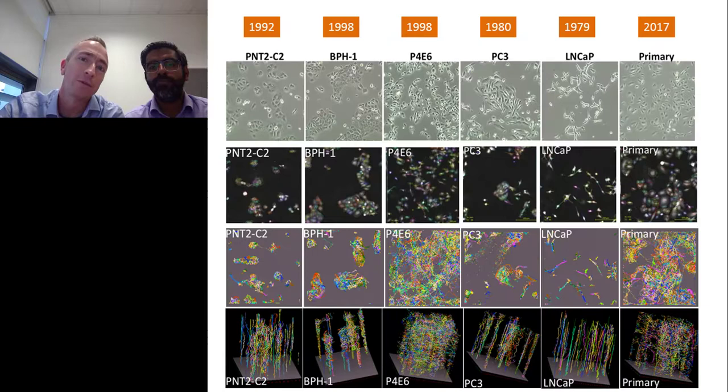And this is just it. If we look back, this is research that they did last year on some of the primary cells. If we look at the time tracks down at the bottom two panes, it's really good to look at the tracks. They behave remarkably differently over the same time frame compared to the other cell line populations that you can see here. It's remarkably different.